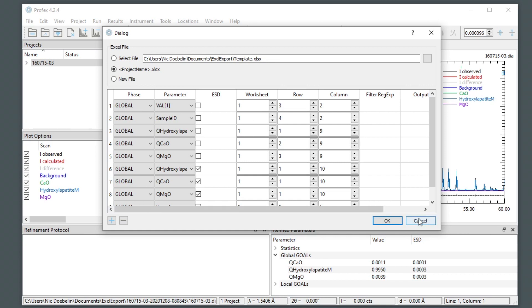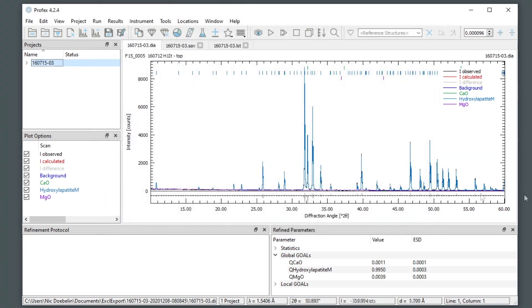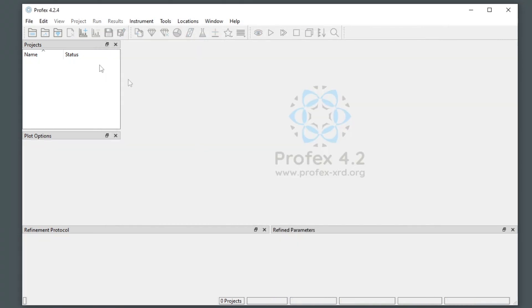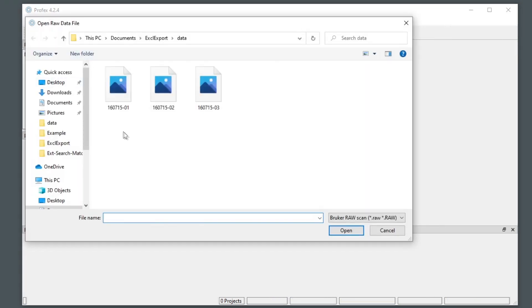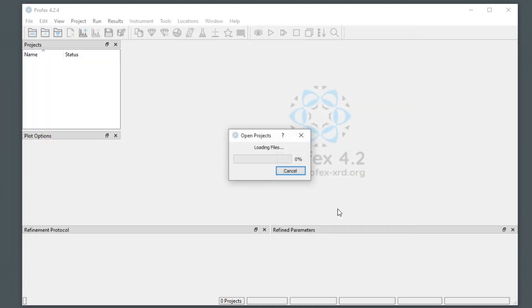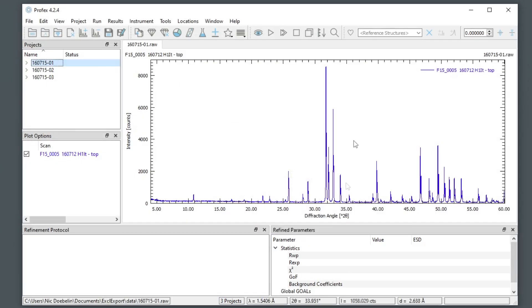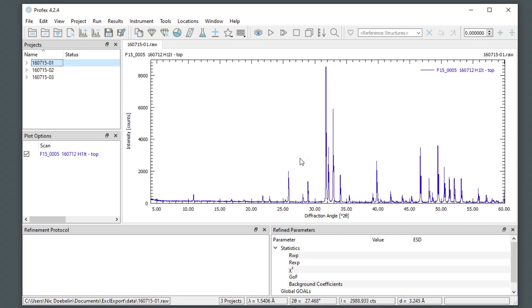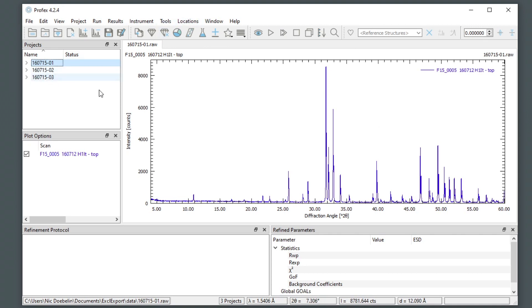Suppose we want to process a list of similar data files, like these three files here. And we want to use a batch refinement with the same preset, and export the results to one Excel spreadsheet per file. And all these spreadsheets should contain some identical information, for example, the address, the name and the address of the customer. And we would like to fill it in only once instead of three times.